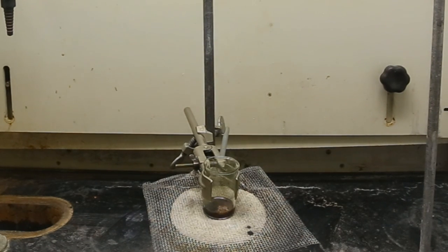This first one, I only used about 2 drops of sulfuric acid. A snake was produced, but it was not nearly as impressive as the ones that I'd seen on the internet. I'm letting this first reaction play out in real time so you can see what it looks like. The second one, I'm going to fast forward until it gets to the reaction. The remainder of this first reaction is about 20 to 30 seconds before it goes off, so you can skip ahead if you are impatient.